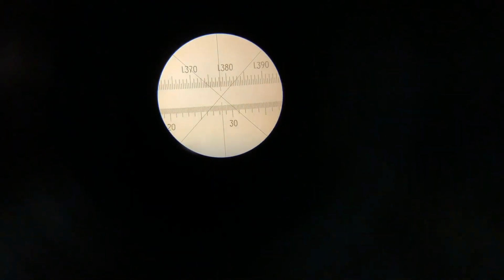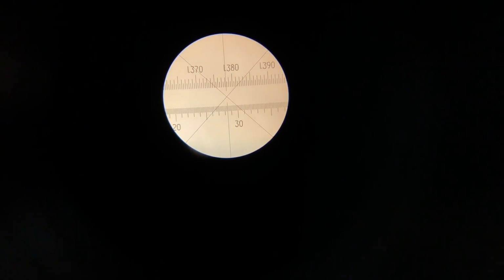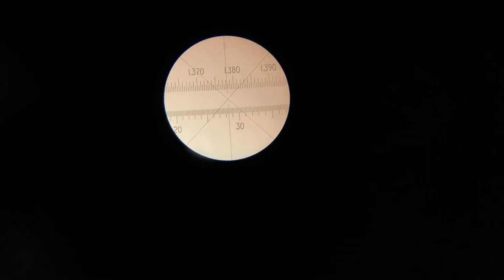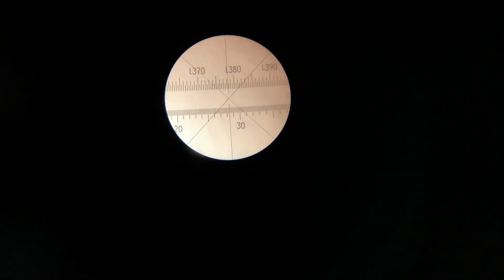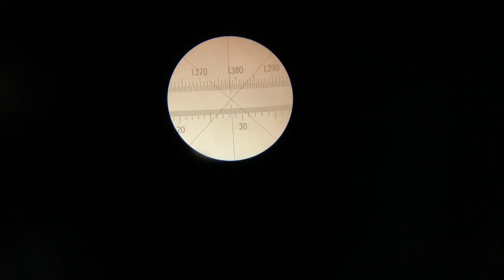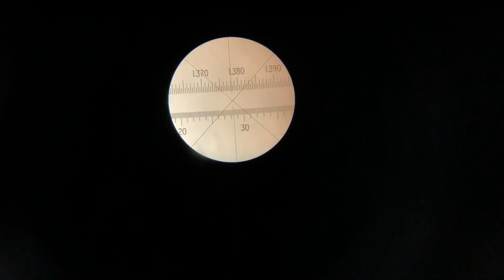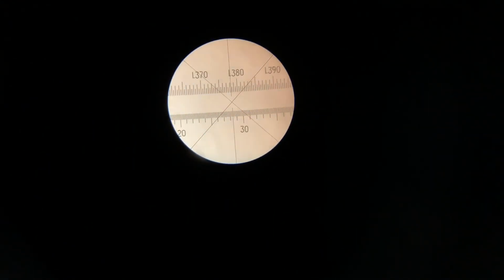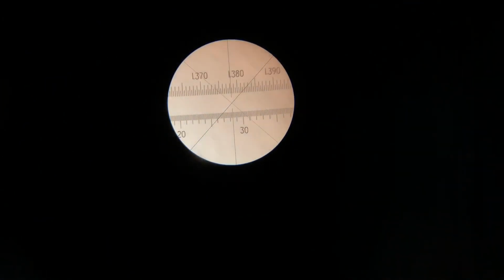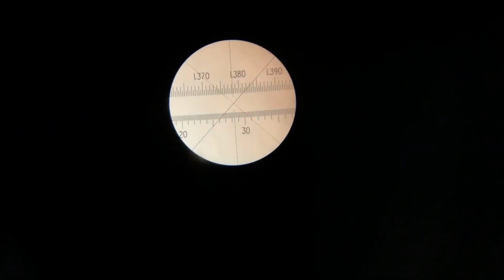And so this is a vernier scale, and if you look at it, we've got 4 significant digits to work with. And so we've got 1.370 going into 1.380. So the 1.375 is right in the middle, and then the medium-sized notches, 1.376, 7, and 8.